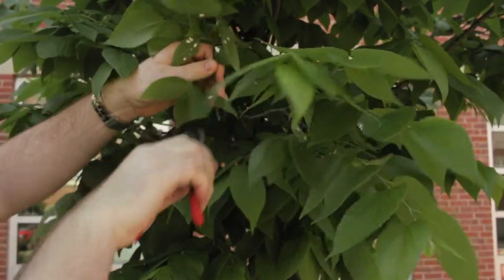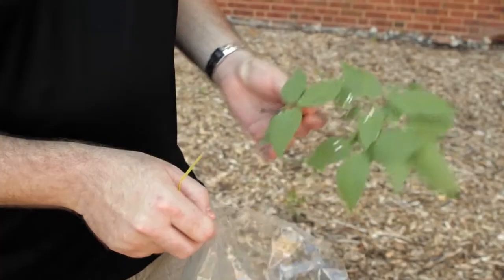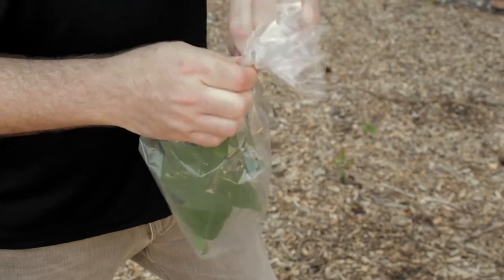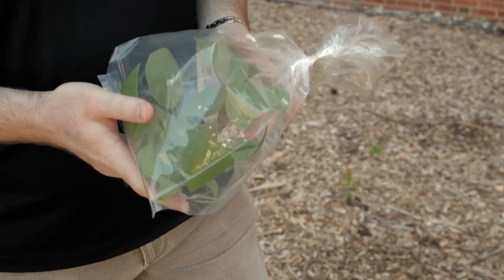First, cut a branch off containing the insects, place it in a bag, and tie the bag together. Send in the entire sample in a bag with the insects included.